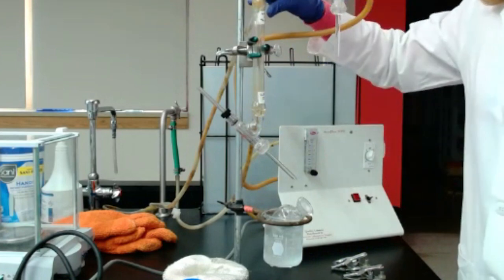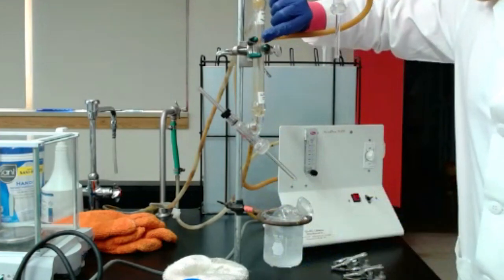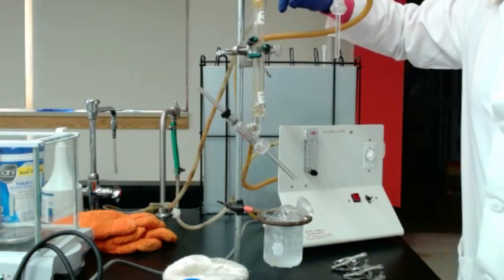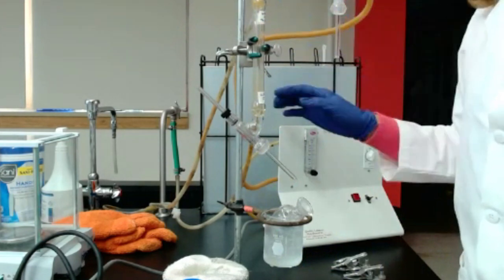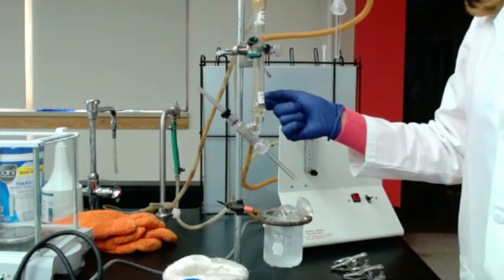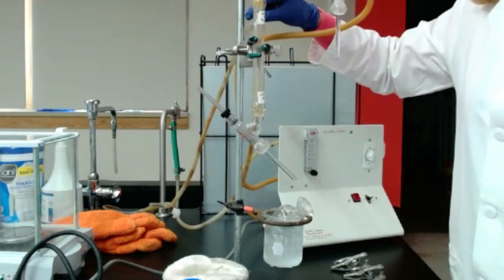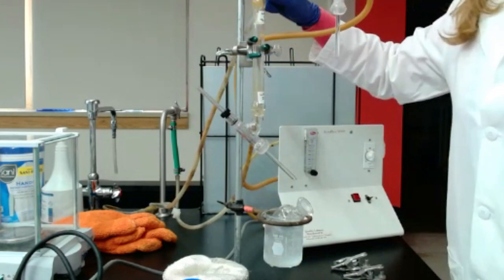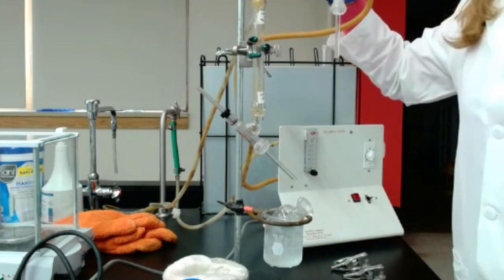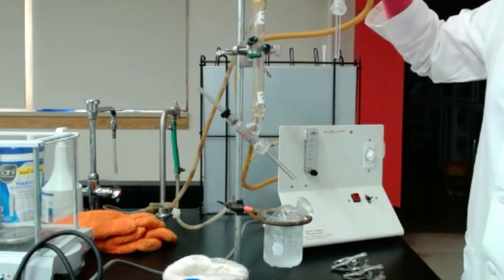And that's really just to make sure when you start using heat for total SO2, you have all the vapor, all the gas, because you're going to form gas that's going to be going through that tubing, and that's not going to be too hot. So that's to cool down the inside a little bit. So in at the bottom, out at the top. And that means you will have to be connected to water. You can connect to tap water, but it's better to have DI water if you can. And also, that tubing is going all the way here.